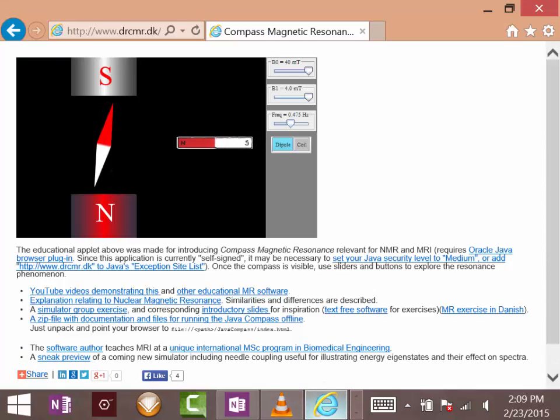If we look at it, this magnet that's going perpendicular to the big magnet is actually electromagnetic radiation from radio waves. So we can take radio waves, we can pulse frequencies of radio waves at a nucleus that's aligned in a magnetic field and start to perturb it off axis and try to find the resonance frequency at which the nuclei gets perturbed off axis. Does that make sense? It's a little abstract. It's a lot of physics.